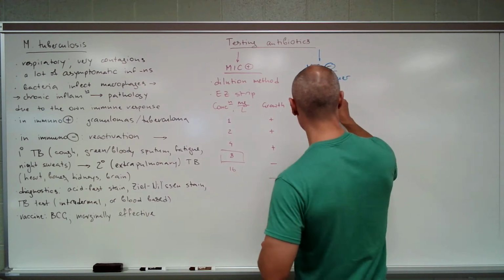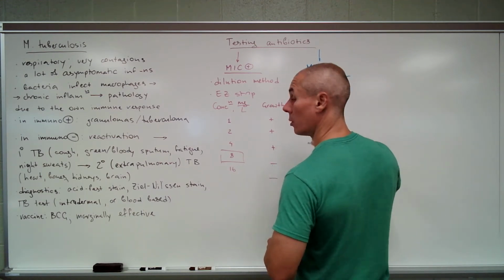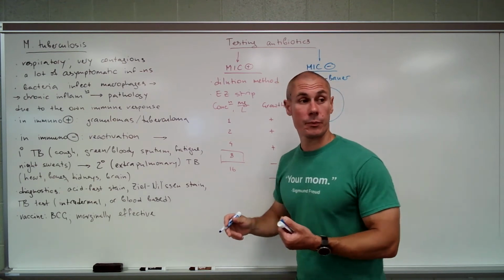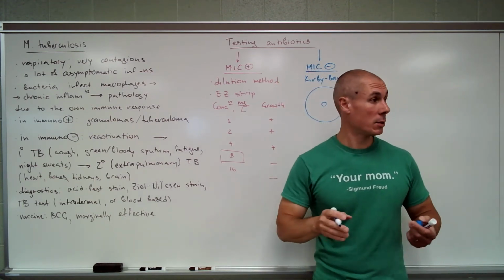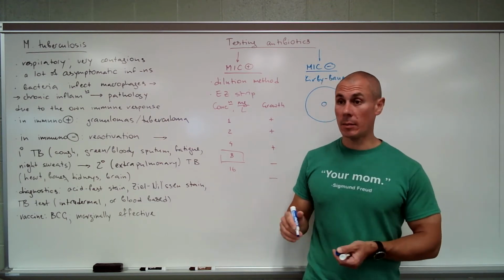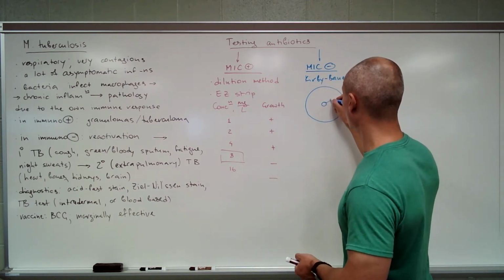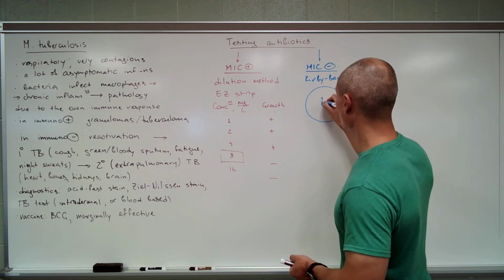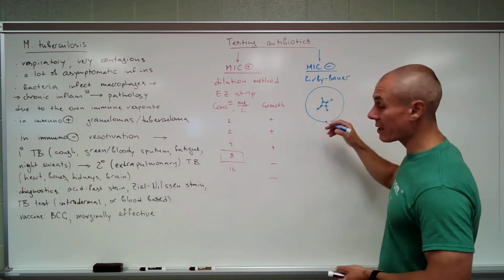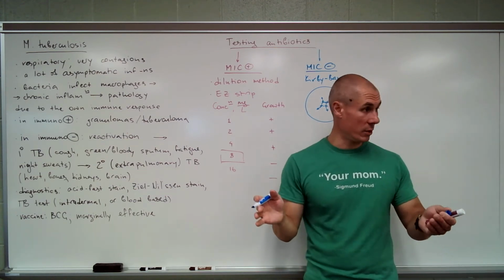You placed a tiny little circle with antibiotic in the center, and what you can expect, this circle starts oozing antibiotic into the agar, and that establishes a gradient around that circle, gradient of concentration. The concentration progressively decreases as you move away from the circle.